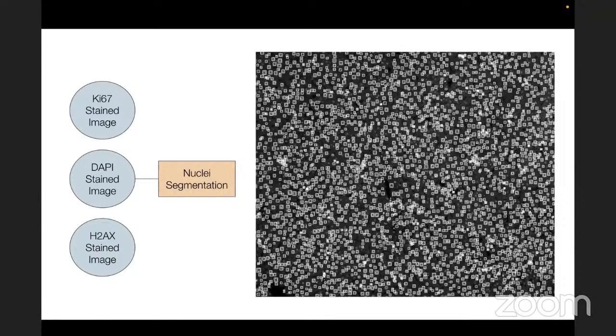It's able to identify using a rotation trick. Essentially it takes the part where the nucleus is detected and rotates it to find the boundaries, and then we've drawn those boundary boxes around the nuclei. In this image, we detected 3,000 different nuclei, and we're able to use these coordinates in our future analysis, so we don't have to search every part of the image. So we get the nuclei segmentation. We have all of the boundary boxes where we've detected these nuclei.